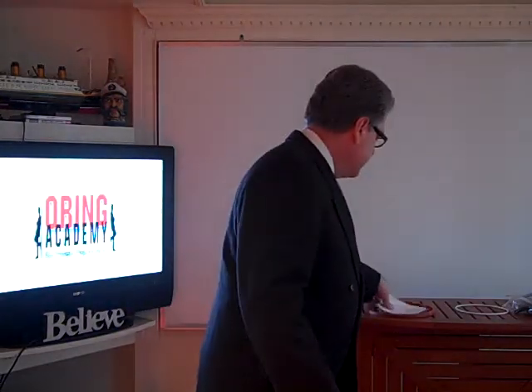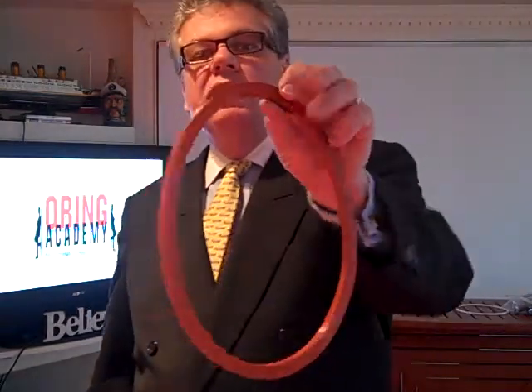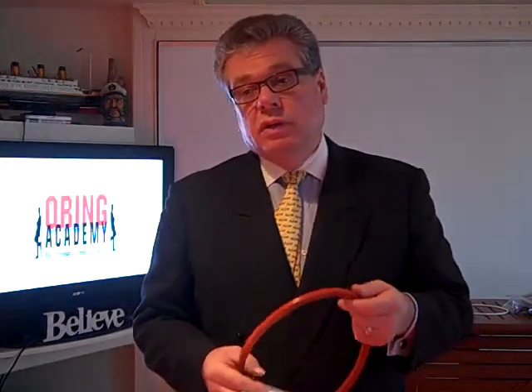I have four sizes that I'd like to share with you. You can have a look to see what it looks like — it's kind of a square gasket, and it's orange in color. I have the 1730 model, the EZ9 for the 2340, the EZ10 for the 2540, and the 3850 for the larger units.